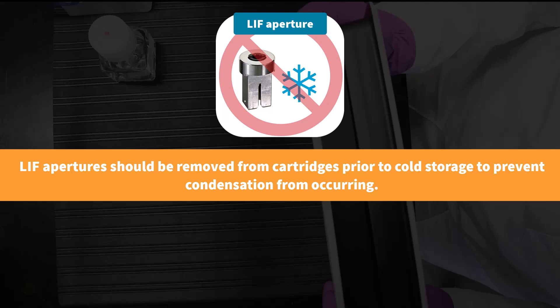If your capillary requires storage between 2 and 8 degrees Celsius and is used with the LIF detector, you should remove the LIF aperture prior to cold storage.